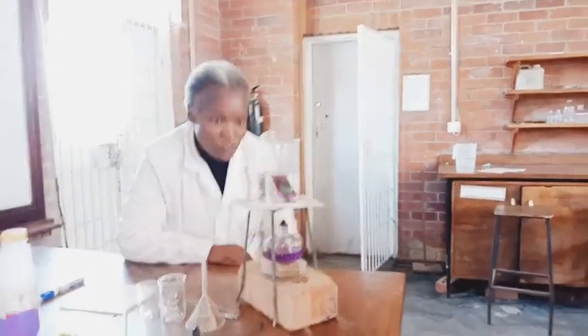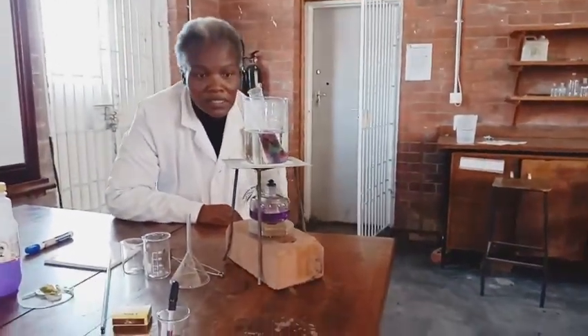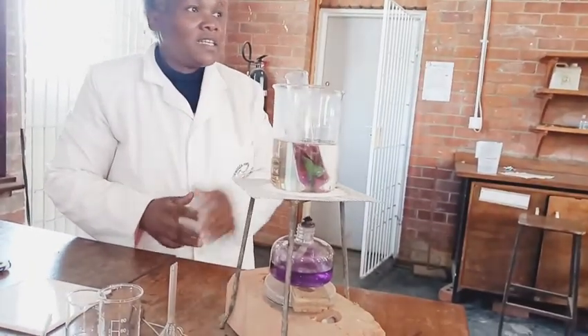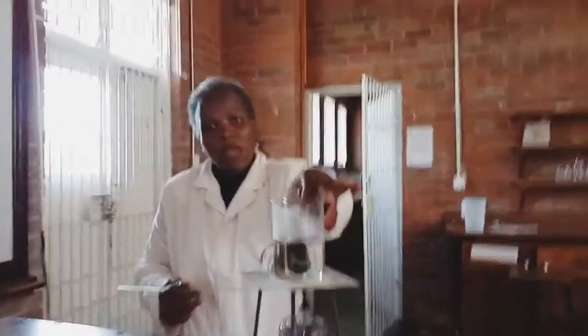The alcohol is boiling. Let's wait about 5 minutes. Bear with me for about 5 minutes as this boils. Thank you for your patience.